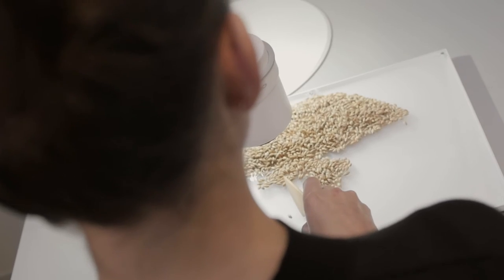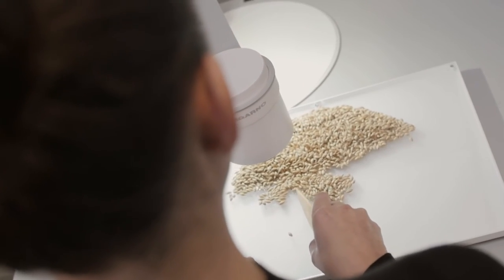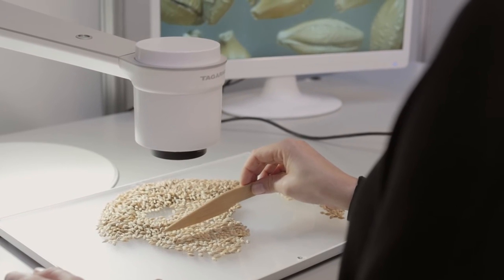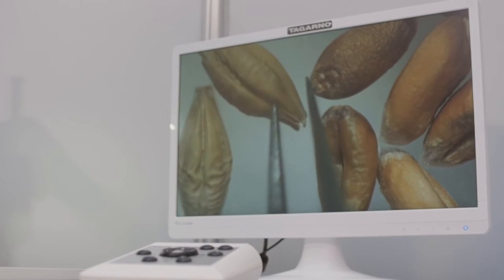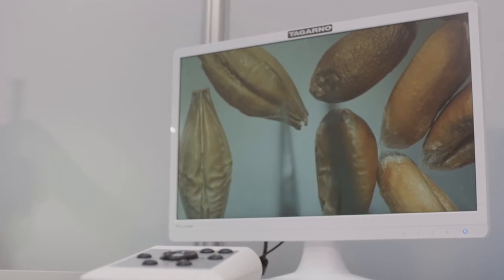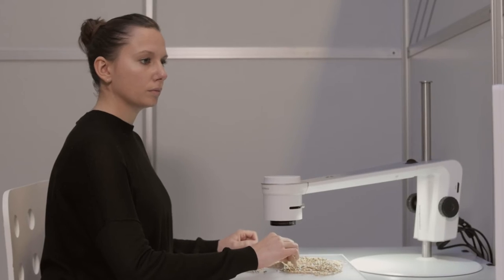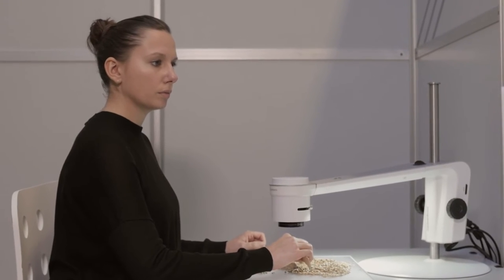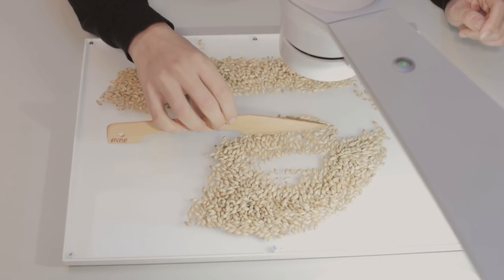The Tagarno is especially useful for varietal identification of barley. When zooming in on the seeds, you can see the characteristics of the seed very clearly. This enables you to differentiate between different seed types and varieties.